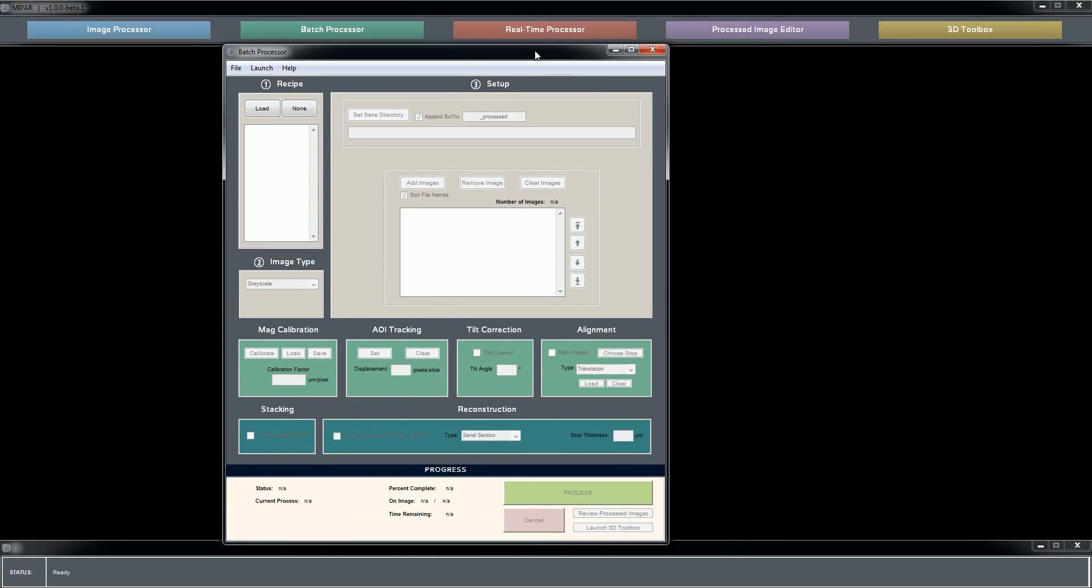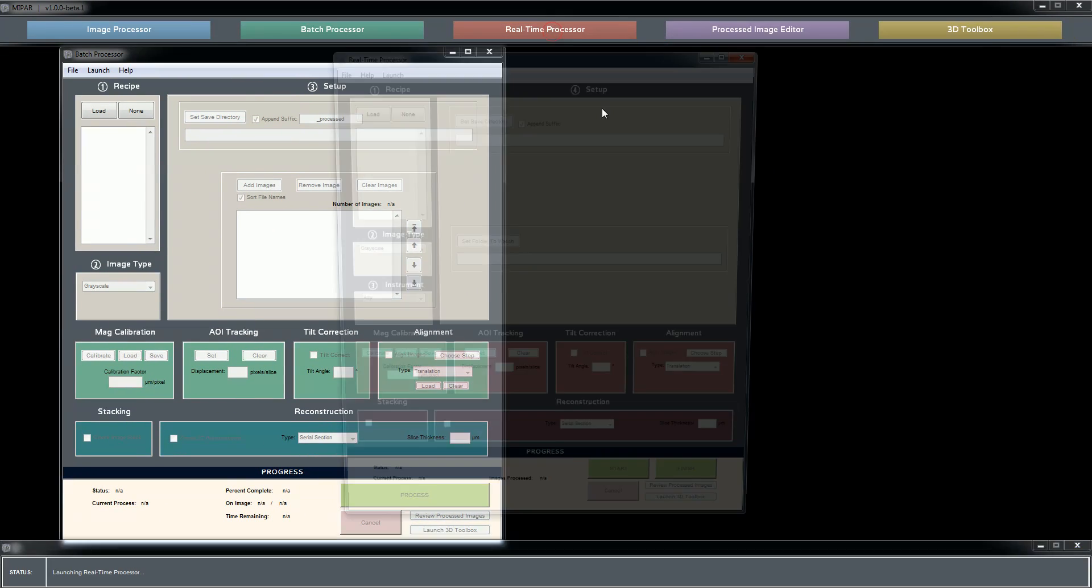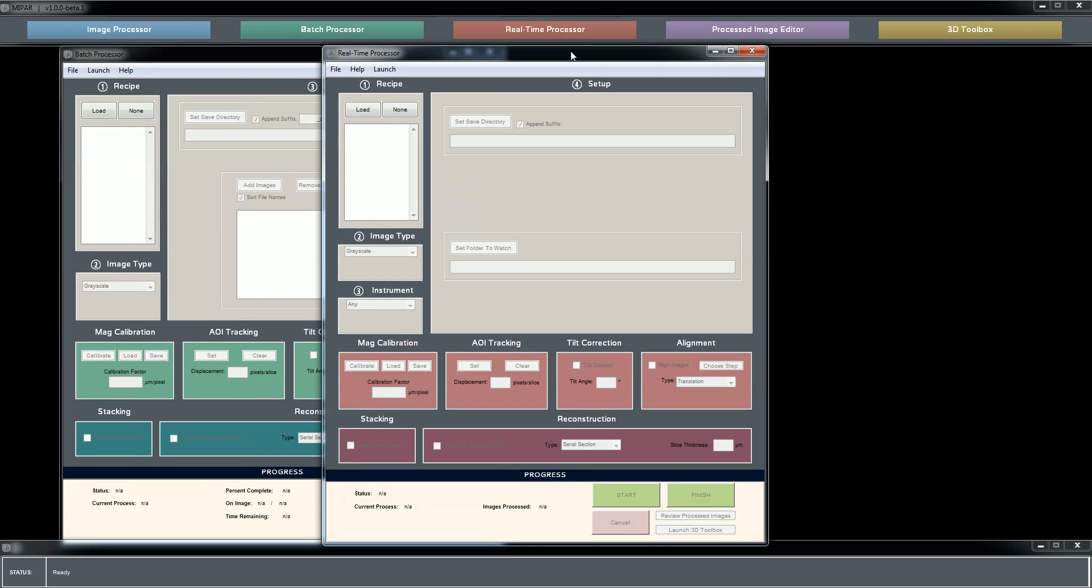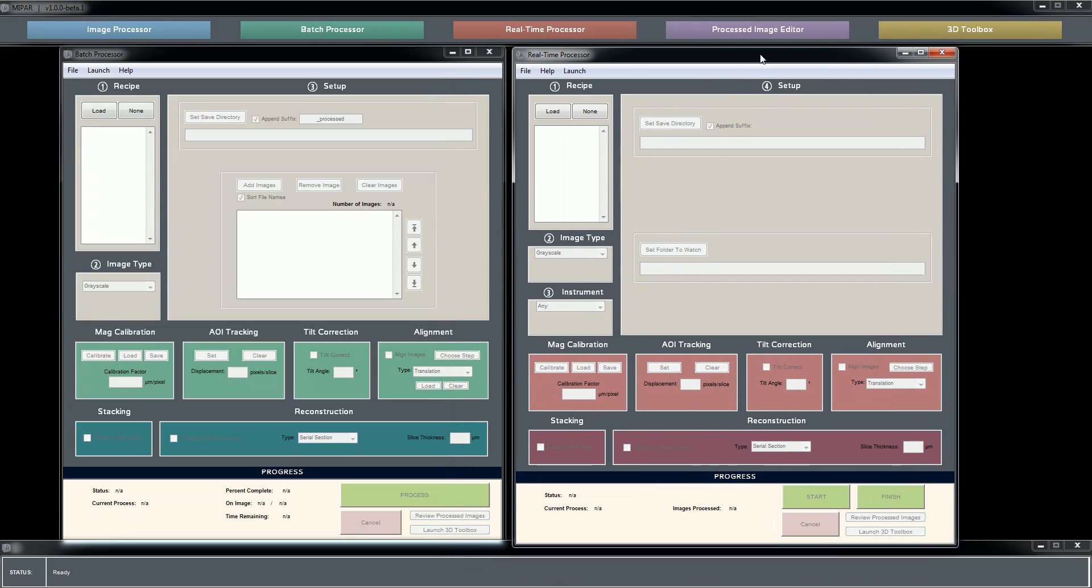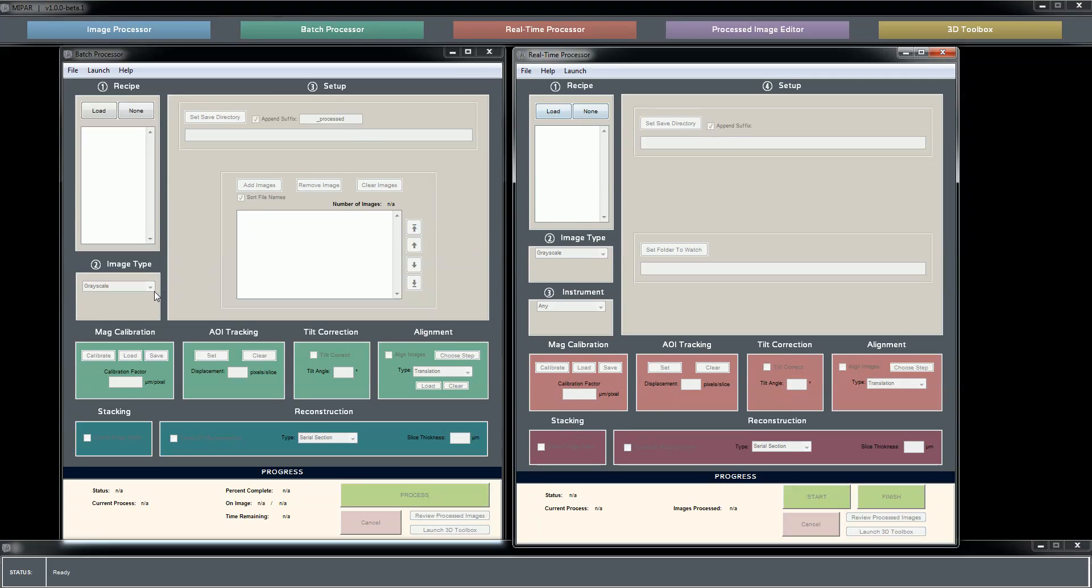The real-time processor is the app that we have used the least and likely will be seldomly if ever used by most of our users, but it's here really for its potential. We developed it alongside the batch processor as sort of a cousin to it, where most of the functionality between the two apps is identical.